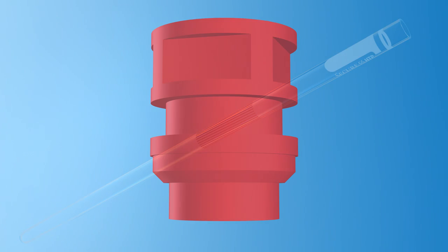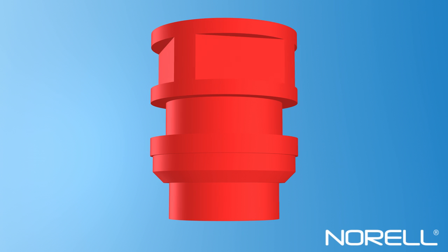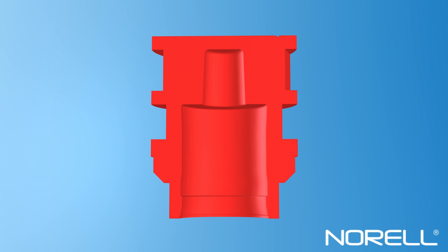The Norlock 2 Security Cap constitutes the second advanced component of the Secure Series line. It has been redesigned internally with the addition of the Security Seal, a secondary locking and sealing element. The Norlock 2 Security Cap uses an internal patent-pending security seal that provides superior hermetic sealing capability on all 5 mm and 3 mm NMR tubes.